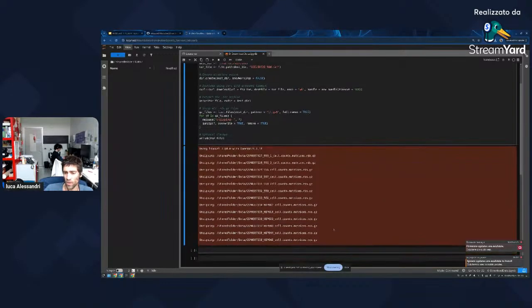You don't need to download all of them. Indeed, downloading all of them and clustering all of them will require a huge amount of RAM. So I don't really suggest you run this on your computer. If you want to stress a server and you have a server, you can run it on your server, but don't do it at home. Don't do it on your computer.